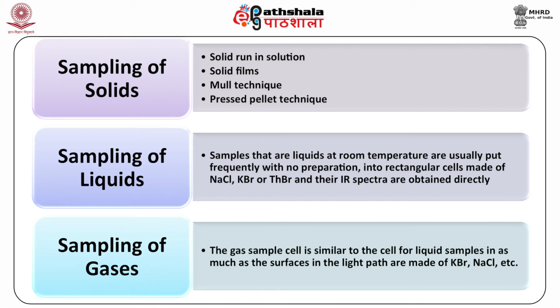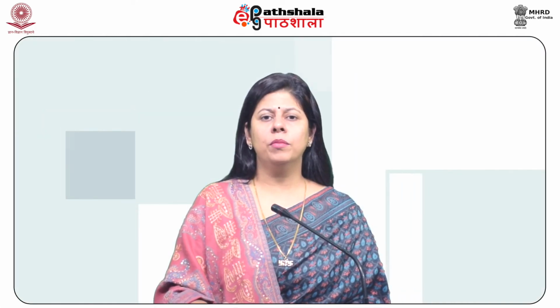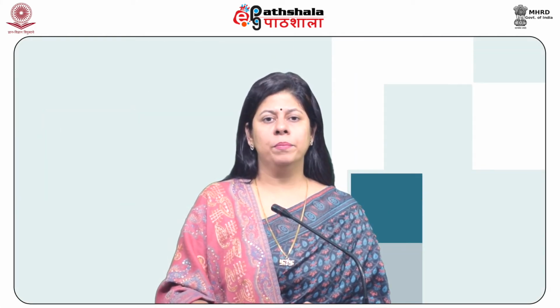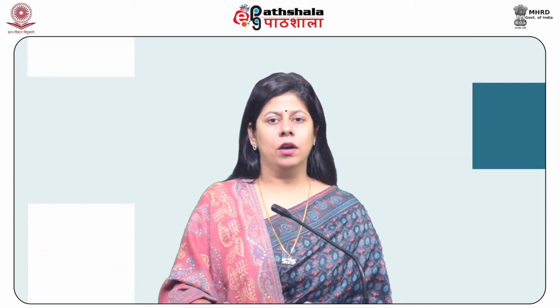Sampling of gases. The gas sample cell is similar to the cell for liquid samples inasmuch as the surfaces in the light path are made of KBr, NaCl and so on. To compensate for the small number of molecules of a sample that is contained in a gas, however, the cells are large.